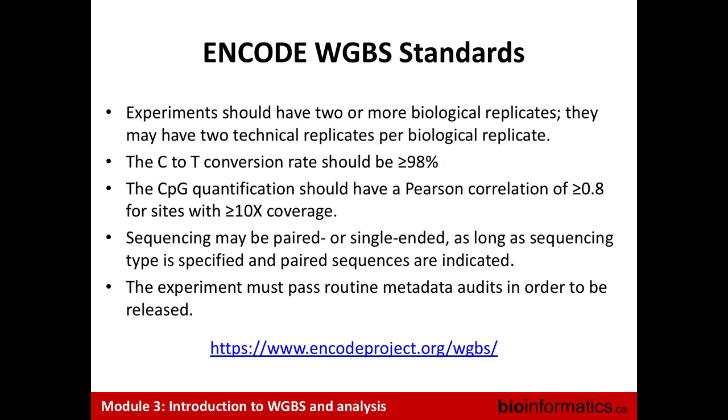I thought I should have a bonus slide. So this is a bonus slide, so I need everybody to look up, otherwise you'll miss it. This is from the ENCODE data portal. They specify their expectations for good whole genome bisulfite sequencing data sets that they want to release.